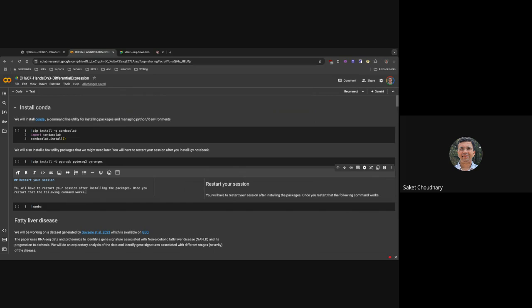For this data set that we're going to work on, there are hundreds of patients. So technically, there's no need. First, two points actually. One is that it's a lot of data. If you want to align 200 patients' data on your computer, the storage itself will start to run away. So that's generally not a good idea. But that's for technical reasons, right? That's not a good reason to not do this analysis.